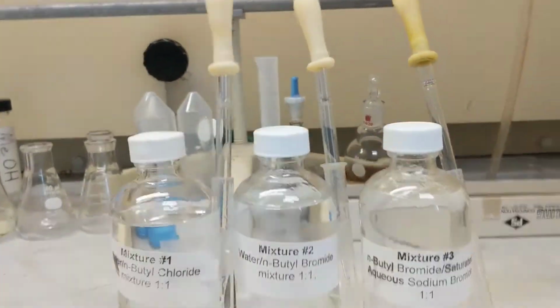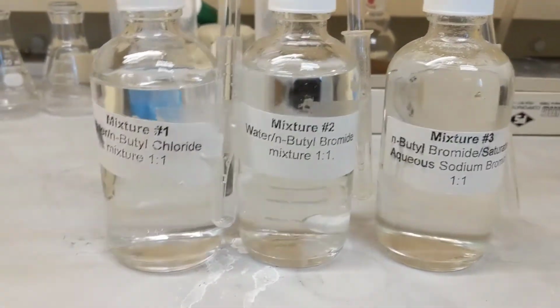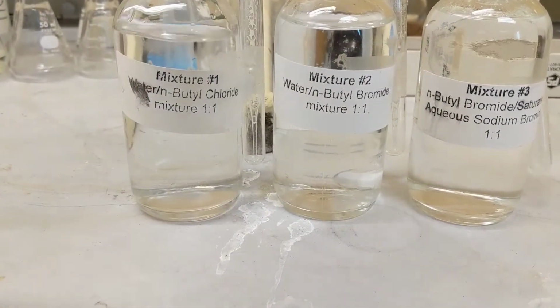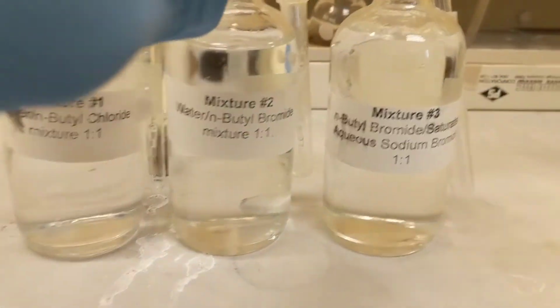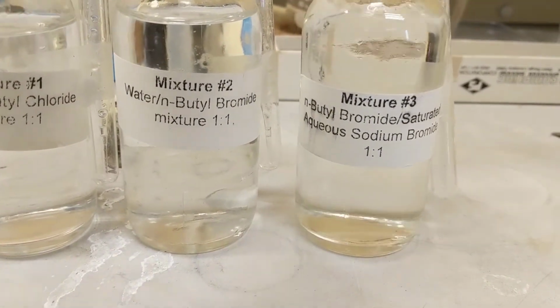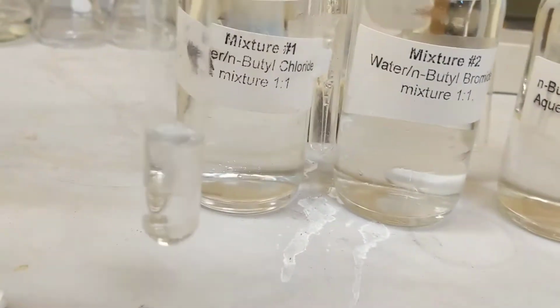Alright guys, this is experiment 3C. We have three mixtures here: water and N-butyl chloride, water and N-butyl bromide, and N-butyl bromide and aqueous sodium bromide. Okay? So this is what test tube 1 looks like.